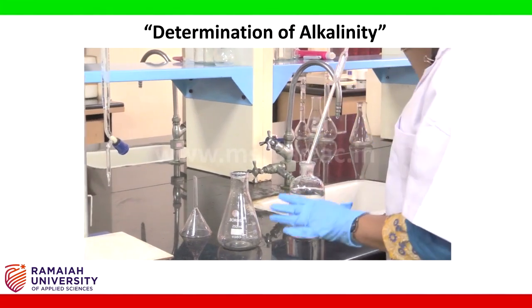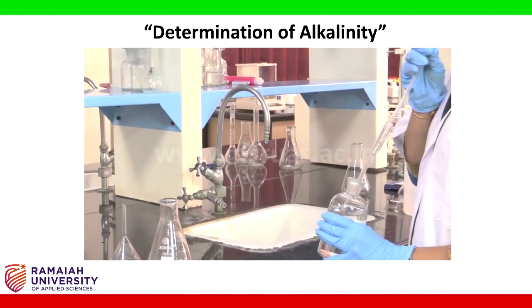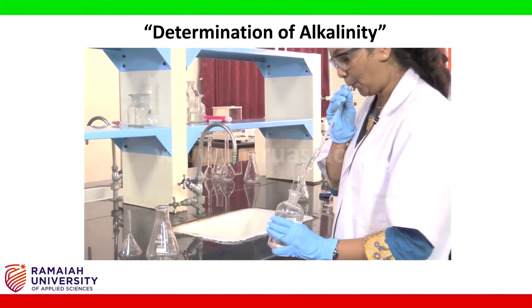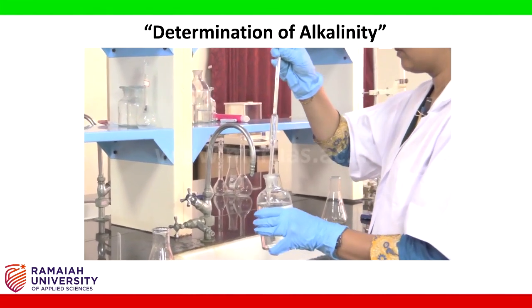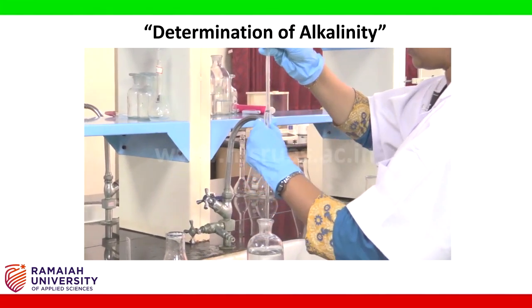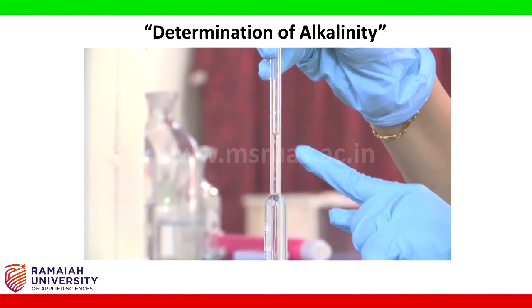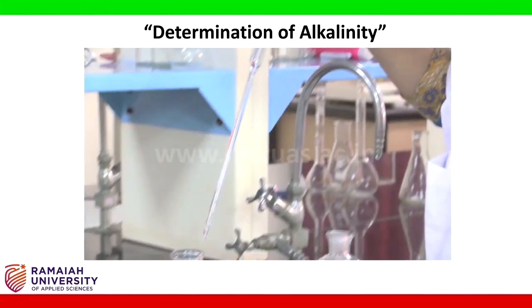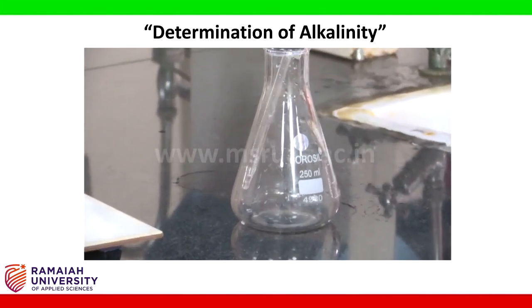So now I am going to take 10 ml of water sample. So the sample has been taken up till this mark. Now the sample is to be transferred to the conical flask.